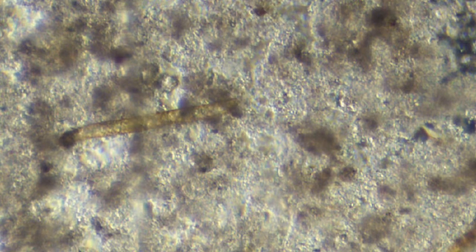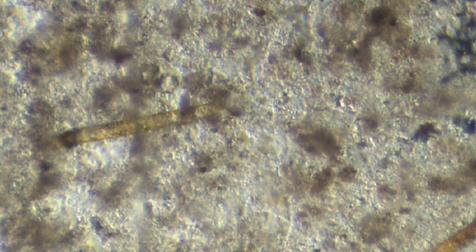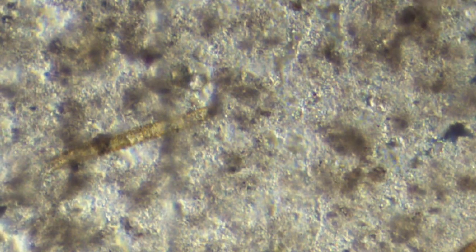Paramecium maybe three-quarters the length of that guy, maybe half. Like that. Paramecium are large, usually. What do we got here?